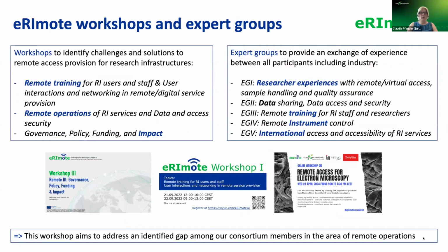The eRImote work project, how it has operated, was that it offered a number of workshops and expert group meetings that first aimed to identify challenges in remote training and remote operations mainly, and then delve further into the discussion with experts on topics such as remote and virtual access, sample handling, quality assurance, data sharing and data access and security, remote training for RI staff, and researchers, remote instrument control, and international access and accessibility of RI services.